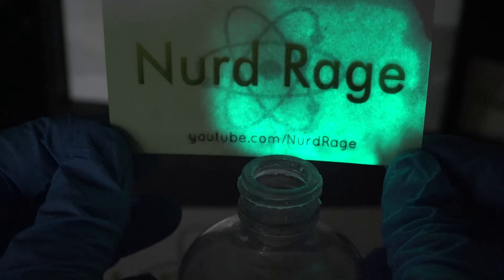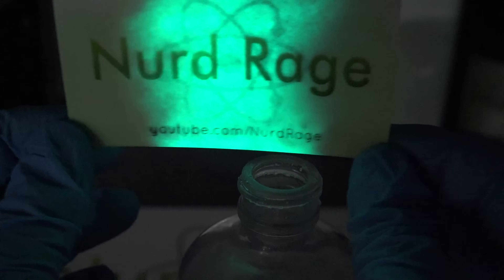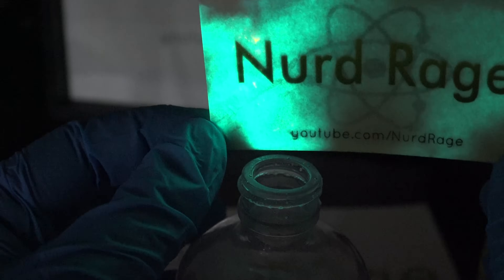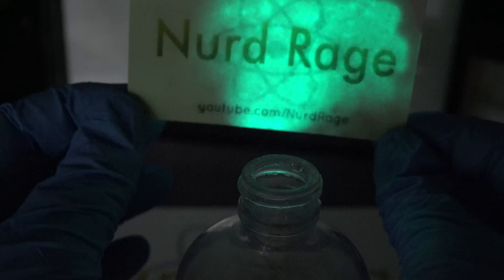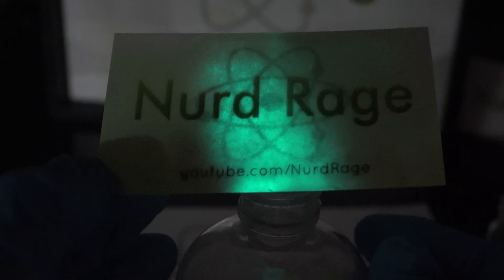It's really unfortunate that oxal chloride is a toxic lachrymator — inhaling it is very dangerous. I could see this effect being an awesome magic trick or even a practical effect for videos; you can pretend you're casting spells or something. But as it is, this YouTube video will probably be the closest most people will encounter this safely.